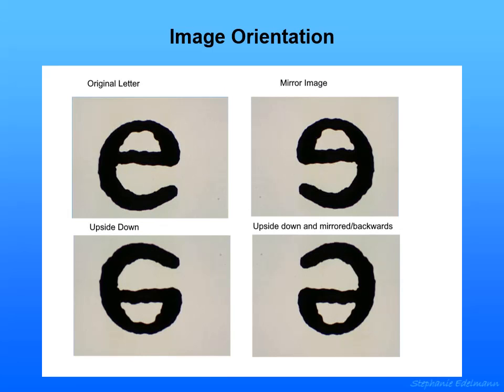One of the first things we want you to understand is that the image that you see under the microscope may or may not look exactly the same way as it looks when you put it there. You won't notice that, right? Because all you see under the microscope, you don't have any reference for what's up, down, forward, backwards. And so one of the first things we have you look at is a letter E. And when you put that down under the microscope, you make a wet mount, and there's instructions how to make a wet mount in both the Google site and the Blackboard site.